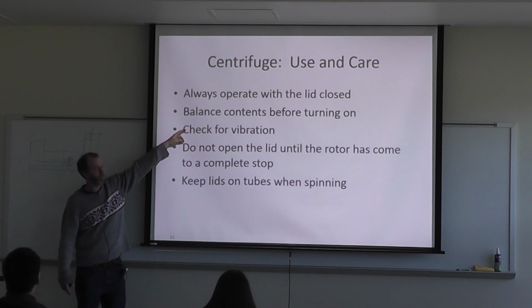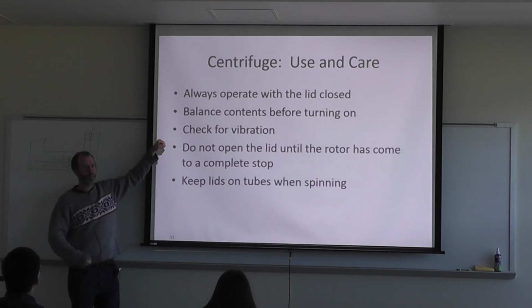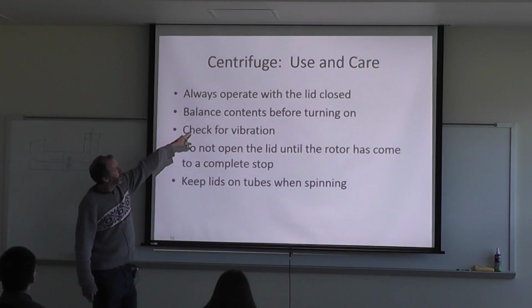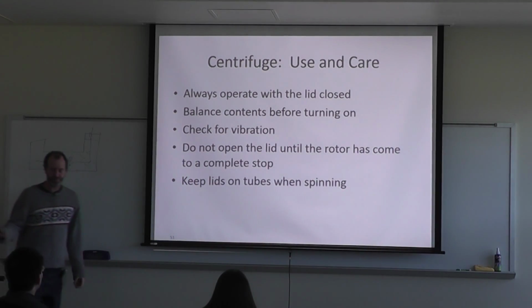So centrifuge use and care: always operate with the lid closed. I don't do that. In fact, I used to have a centrifuge I had to rig so that you could have it open or closed because the thing didn't work. Don't do that. You're not supposed to do that in the lab. You always want to balance the contents before turning on. You guys know this, right?